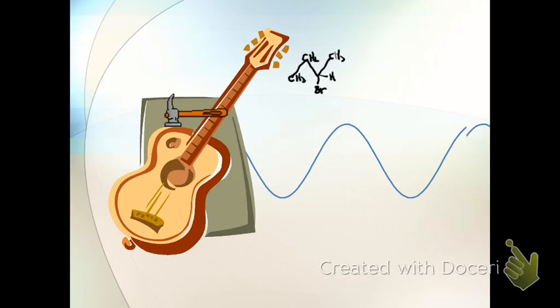In this analogy, when you strike the molecule with an electromagnetic pulse, there are all kinds of crazy energies coming out of it, so you could expect a lot of noise. This is time on this axis, and on the vertical axis we just basically have energy.